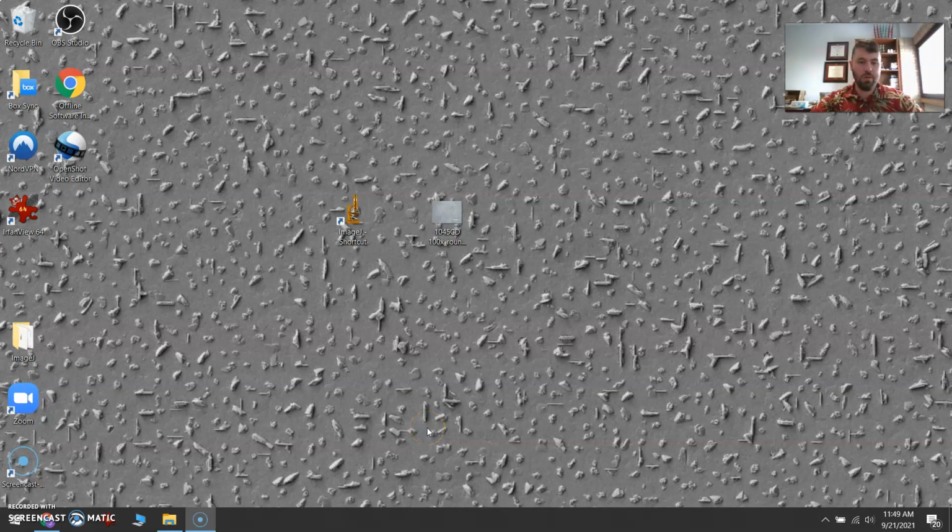Hello everyone. I wanted to walk you through how we do grain size estimations using the software known as ImageJ. This is going to be part of your lab report for Unit 1. So I wanted to show you pretty quick how we do it on our steel samples.